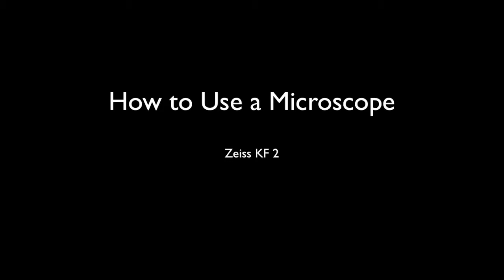The purpose of this video is to illustrate how to use the Zeiss KF2 Student Microscope. Using a microscope correctly is a skill that you need to develop, not only for the present biology course, but also for the future.